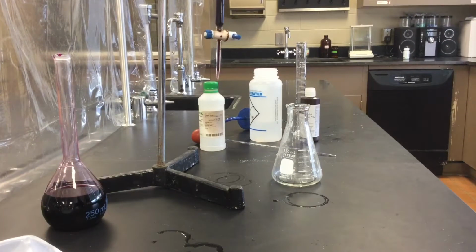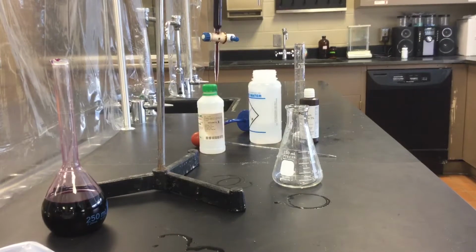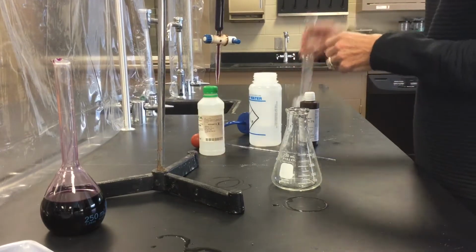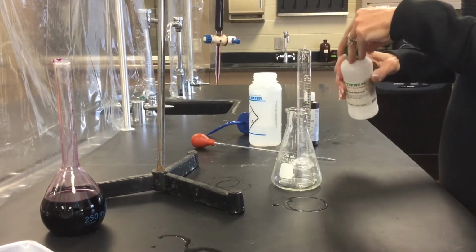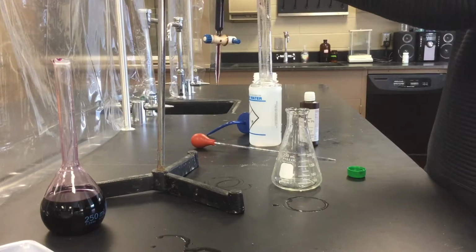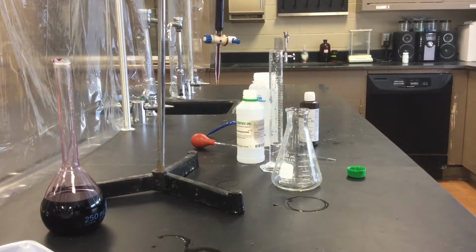So pretty much the same procedure as last time, just swapping out the ferrous ammonium sulfate for hydrogen peroxide. I'm going to do 10 milliliters of the sulfuric acid again. Make sure, can you see okay?